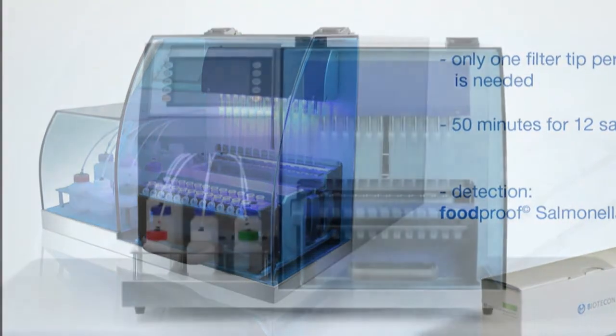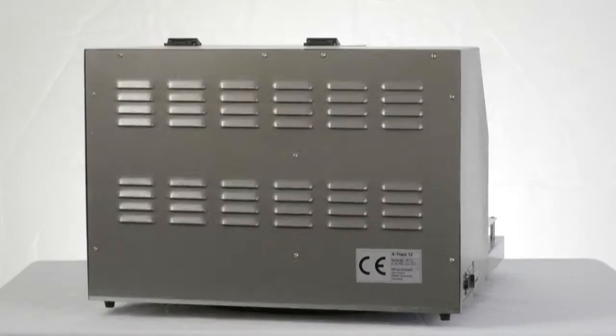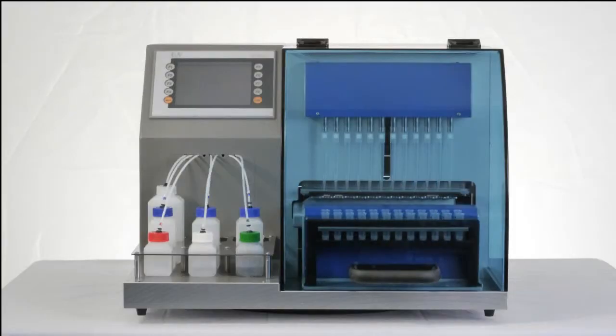In this video, we will demonstrate the basic steps of DNA isolation for salmonella detection performed on the Foodproof RoboPrep Extract workstation.